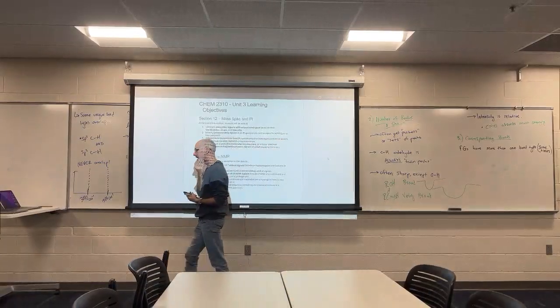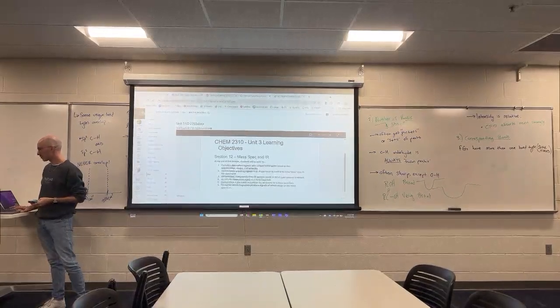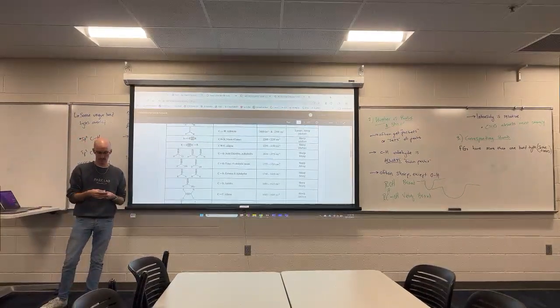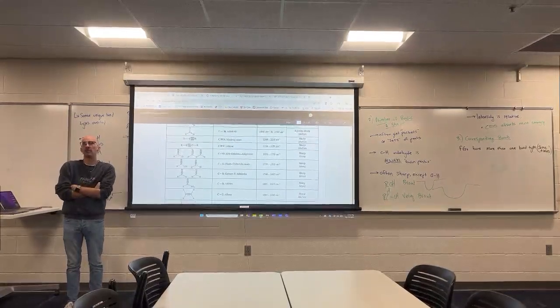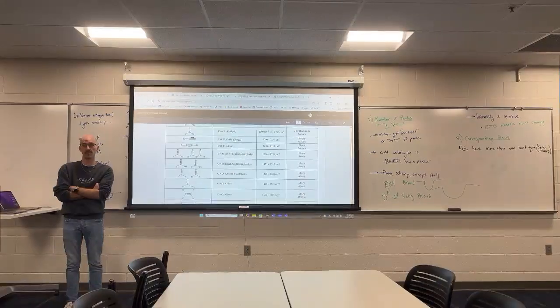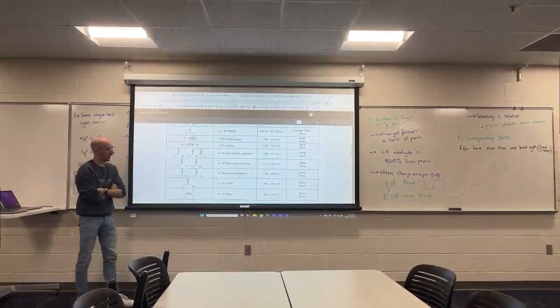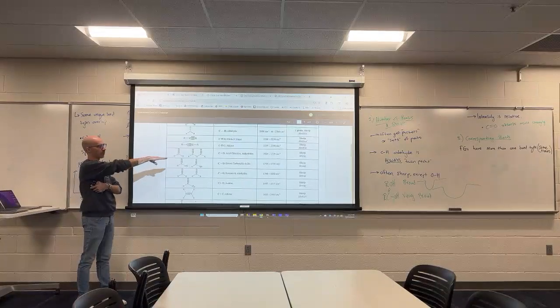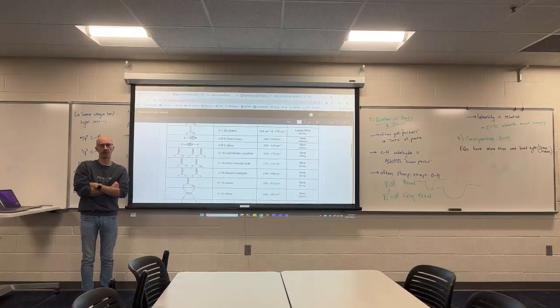So here's something I struggle with. I think it's a personal problem. Students will fill out their analysis of the organic compounds. They'll look for the IR spectrum. They won't give me a bond type. They just give me a functional group. They say, my compound has an ester. Ester absorbs between 1775 and 1715. No. The ester does not absorb between 1775 and 1715.